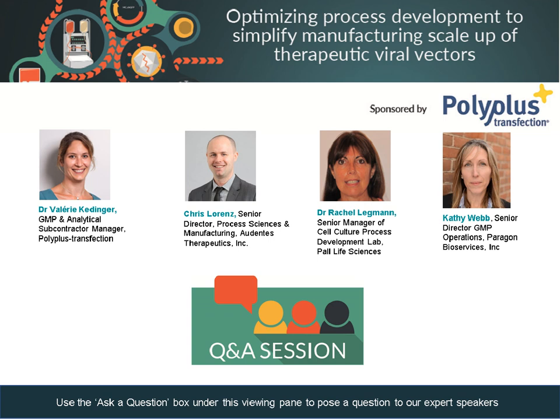Fantastic, thank you. And so moving on to our next question. Alengo touched upon this in her presentation, but it'd be interesting to discuss in a bit more detail what factors the panel think have more influence over transfection efficiency, and how are you able to monitor these in such a dynamic process? What are the key criteria you need to measure to ensure your transfection process is proceeding optimally? Rachel, perhaps you could start us off here with your thoughts.